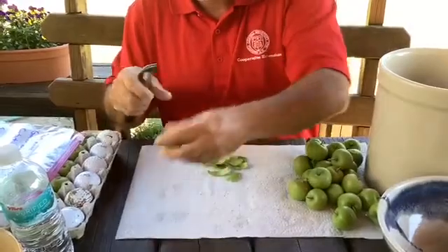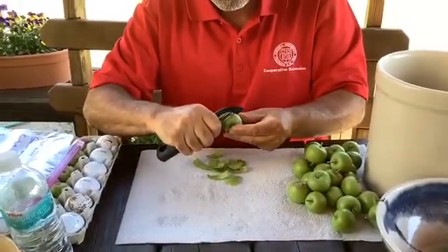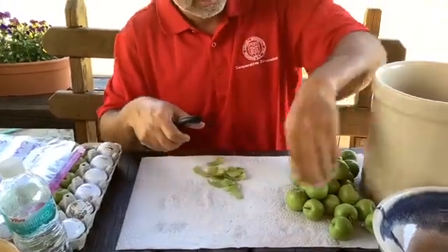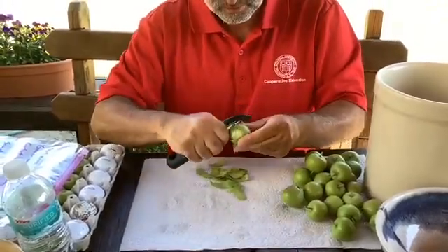very quick. The way I do it in the lab is always from one side, and I turn the apple. That is the way we do it, very quick in the lab.